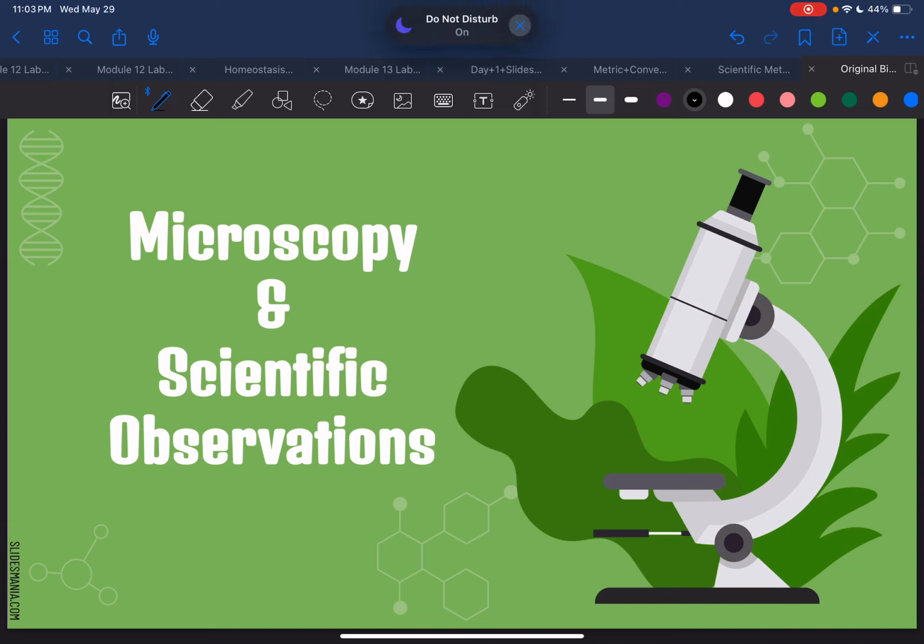Alright, you guys, let us go ahead and talk about the microscope. So hopefully you watched the previous video that was talking about cells, the difference between prokaryotic and eukaryotic cells. So now we're going to take a look at and talk about the microscope, how it works. You are going to be required to know the parts of it and what those parts do.